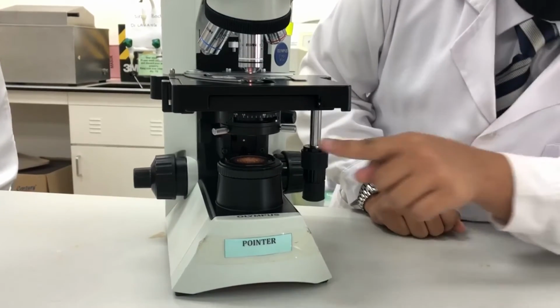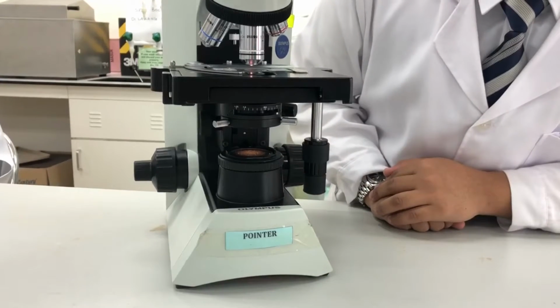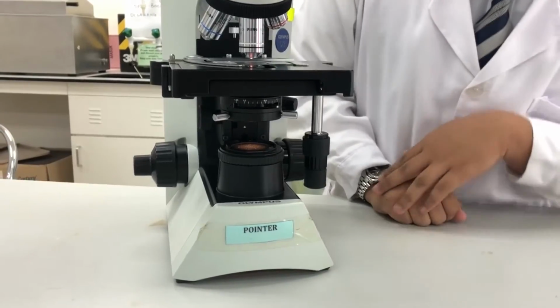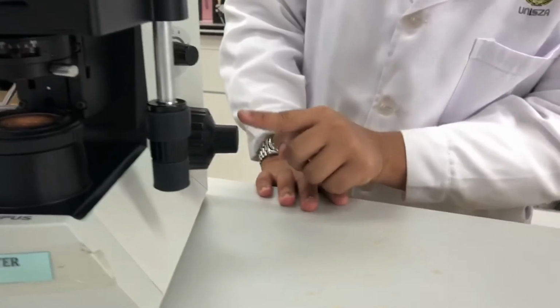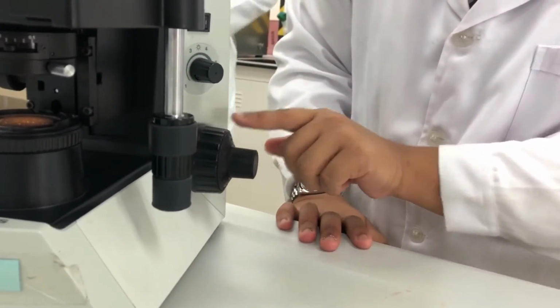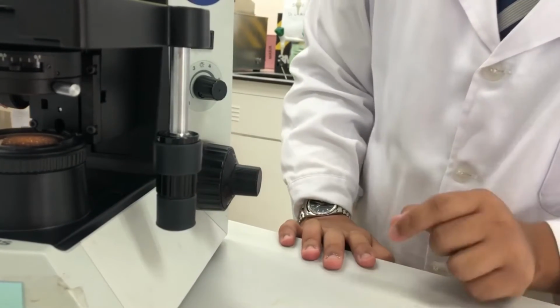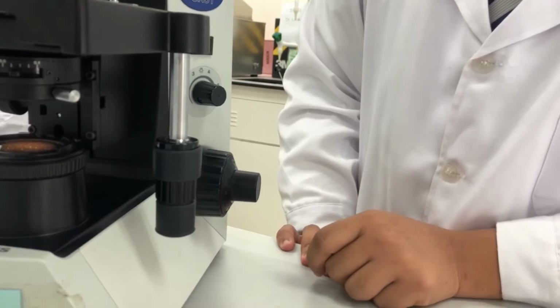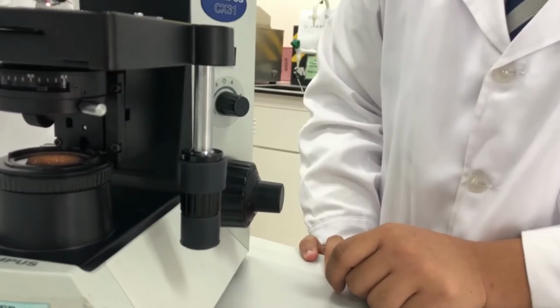And the next one is the microscope illuminator. This is the microscope's light source located at the base. It is used instead of a mirror. And the next one is the coarse adjustment knob. It is used to move the stage up and down to bring the specimen into focus. And as you can see, the fine adjustment knob brings the specimen into sharp focus under low power and is used for all focusing when using high power lenses.